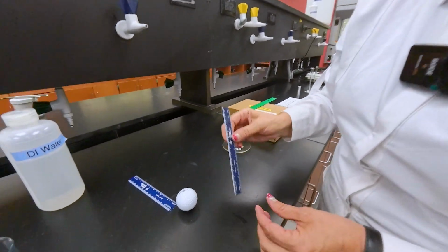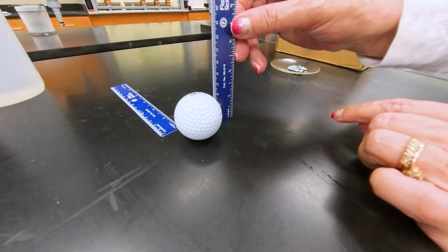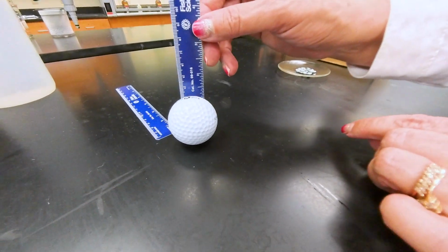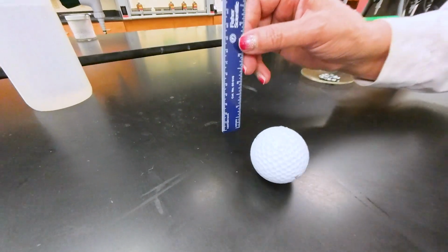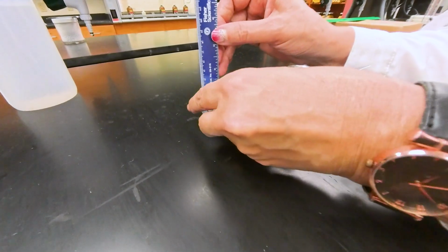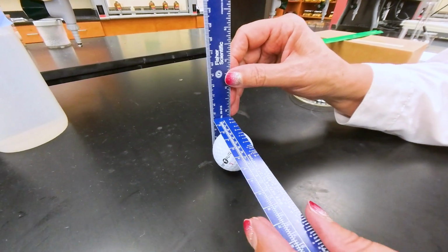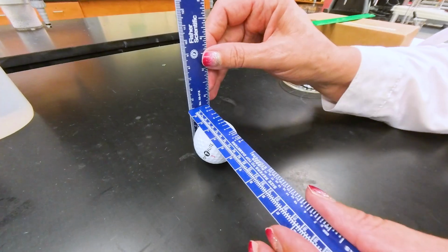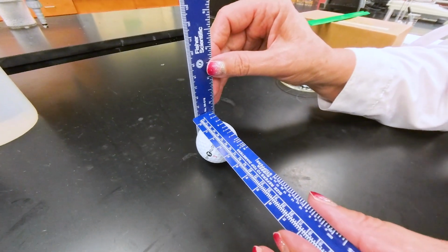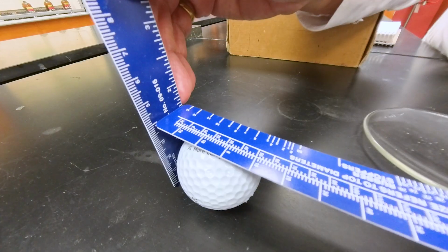For me to measure the diameter, I'm going to measure the height of this golf ball. It's easier for me if I use two rulers, one ruler parallel and one perpendicular to the ruler I'm measuring the height with, and see what number it falls on exactly.